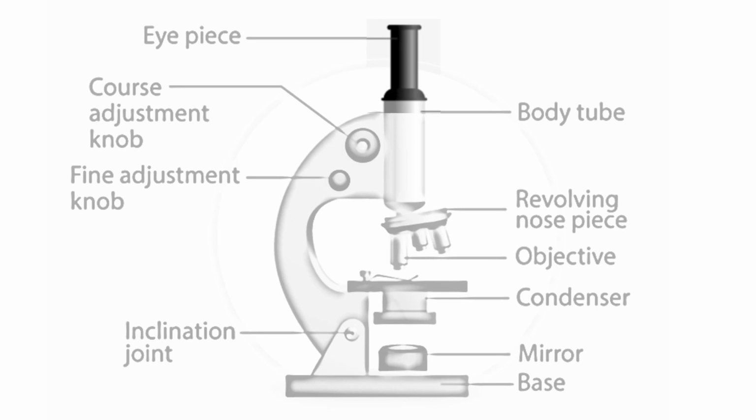The earlier image that we saw is a digital image, but on your screen is the optical microscope, a simple schematic showing the essential components of a microscope. So this is a very simplistic model. Nowadays, many sophisticated microscopes have come up, with greater specifications and enhanced methods. The components are very advanced and complicated, but in this image we are going to see the basic pieces that form an optical microscope.